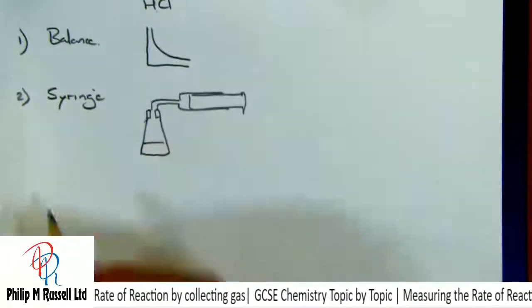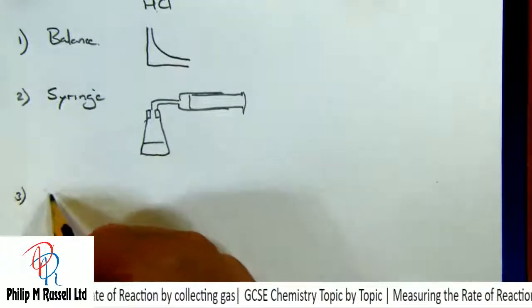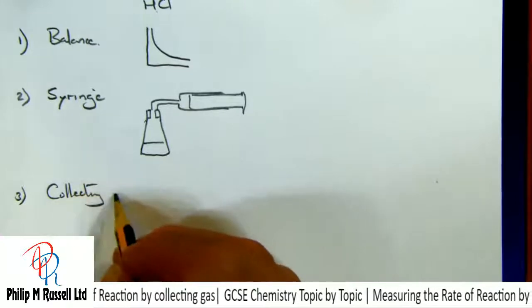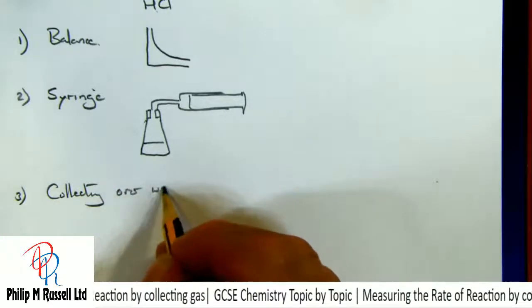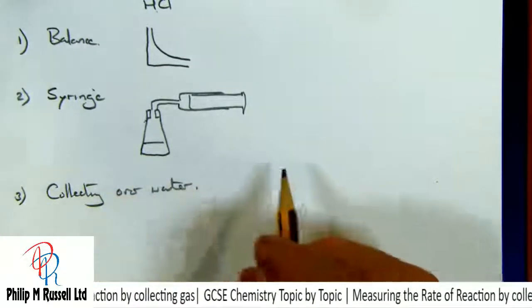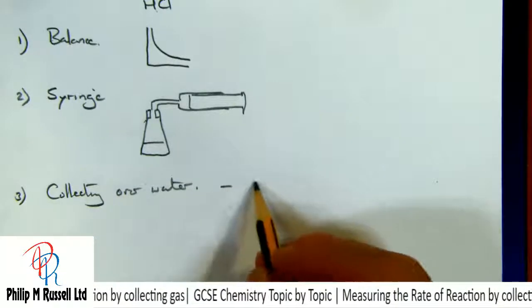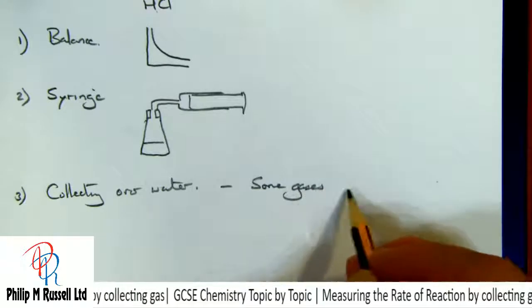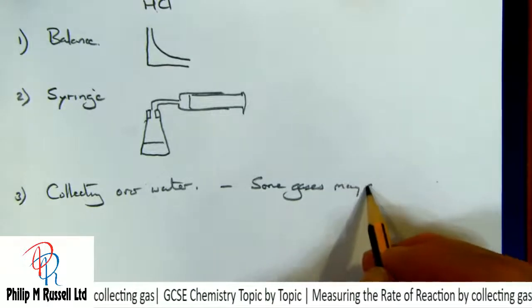The third way was collecting over water. Now, the only problem that we have with collecting over water is that sometimes some gases may dissolve in water.